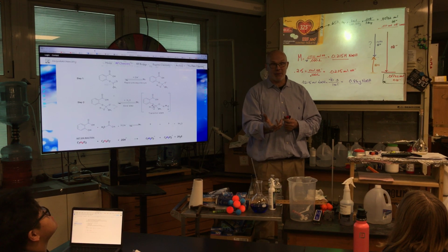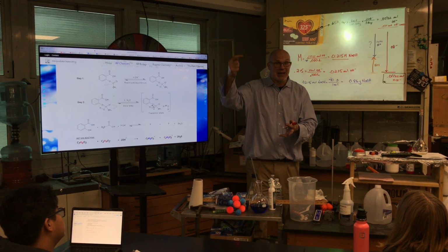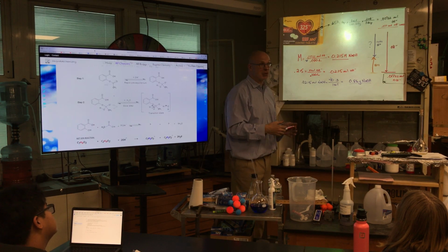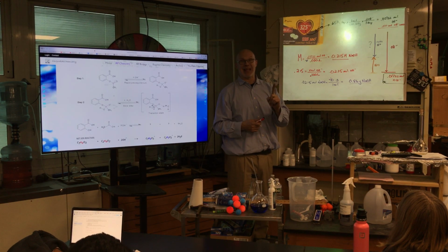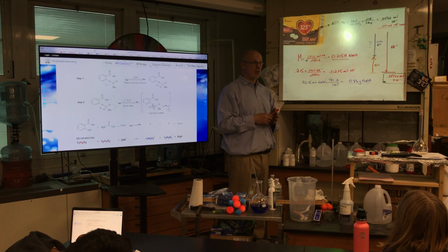Yeah, you're diluting it. If I'm gonna put water in through that, there's water drips and drabs, and now I add the titrant, it's getting diluted. So you always rinse the burette with the titrant, and you have extra to do that. So maybe I'll add 5 to rinse, and I'll add 15. I'm gonna design this around 10. So, how do we solve for the KHP?